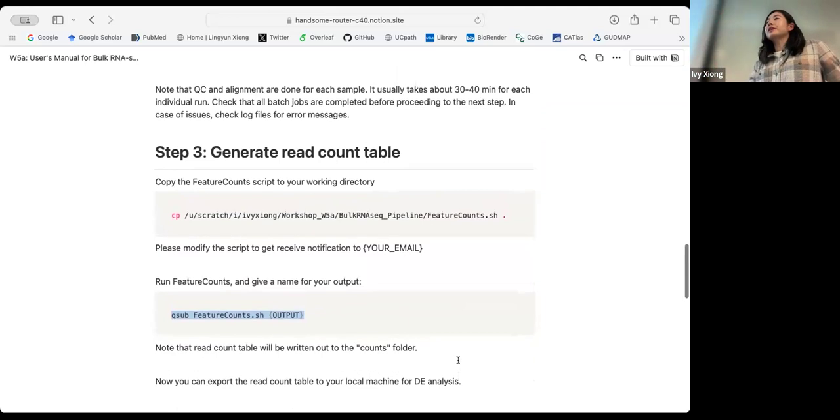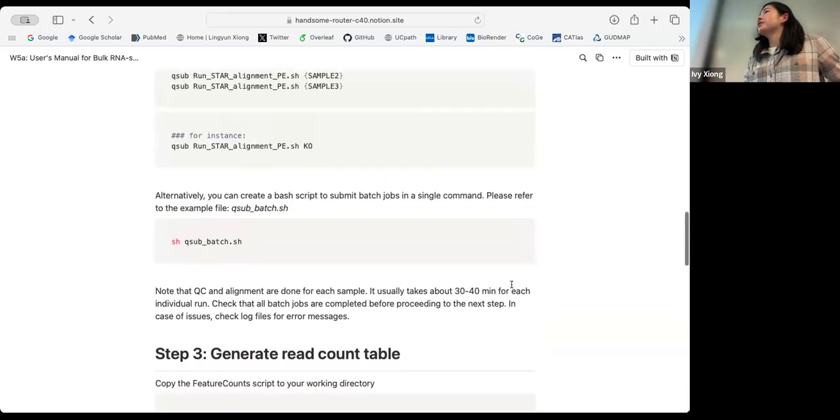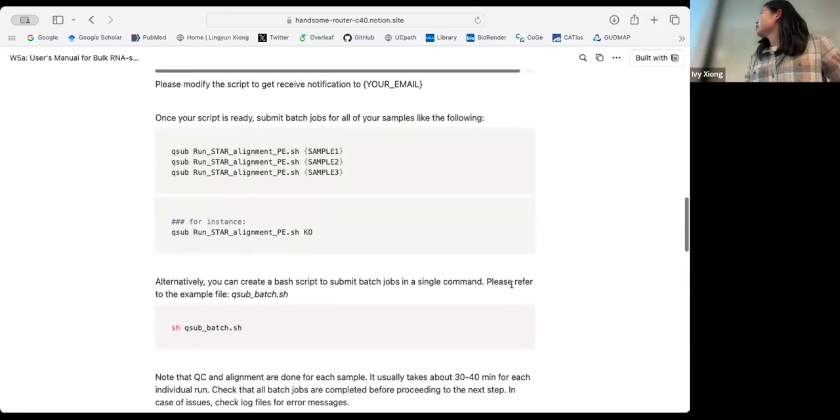Yesterday and today we went through the individual steps: what went in, what you should watch out for, what files are required, and what you should bear in mind when it comes to practice. But this pipeline hides all the details away so that you can handle multiple samples in an efficient and highly organized manner. So that's the idea.